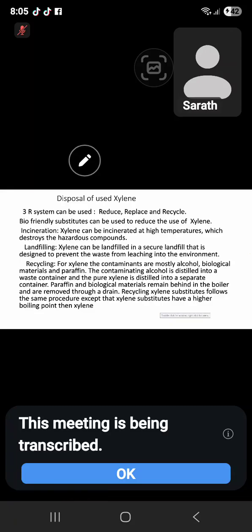Bio-friendly substitutes can be used to reduce the use of xylene. Xylene is not bio-friendly, so you can use some bio-friendly substitute like cedarwood oil and other things. Those are bio-friendly, user-friendly. Then how do you dispose? Incinerate. Xylene can be incinerated at high temperature, which destroys the hazardous compounds. But you can't do it in your laboratory premises or outside because you don't have the facilities. Then you have to use an incinerator with a high chimney.